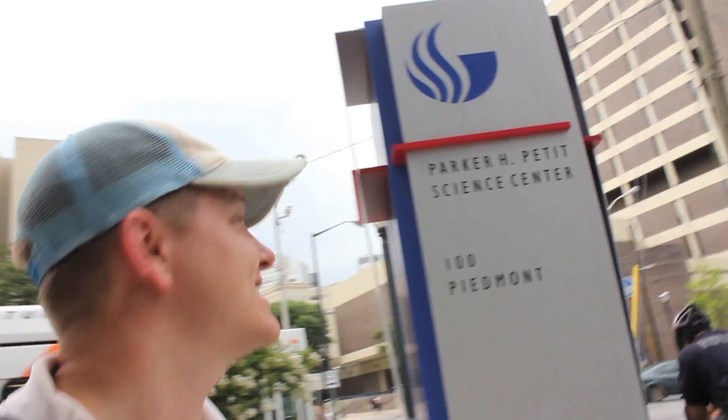So to figure out what this is, we came to the Pettit Science Center here at Georgia State University. We're going to the Biological Imaging Center. Dr. Simmons, nice to meet you.